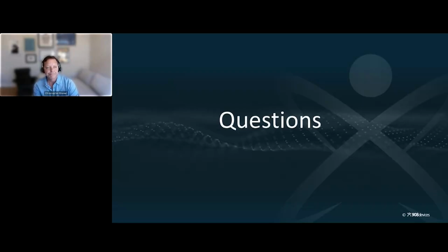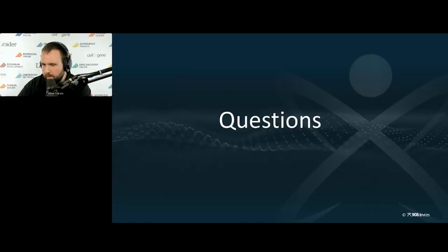Awesome. Thanks, Chris. So let's see. Someone else is asking, what are the first steps that they would take to set up the Maverick for inline monitoring? Yeah, it comes down to that 1, 2, 3 slide I had.